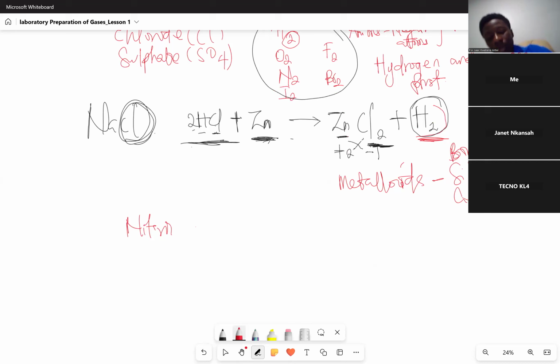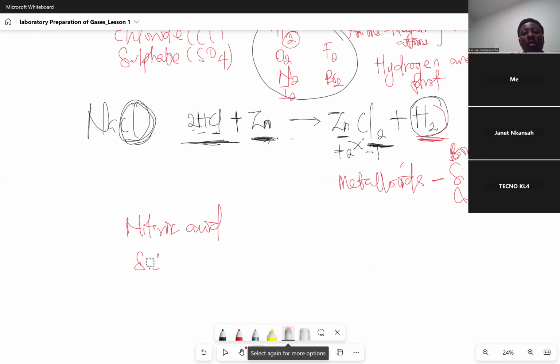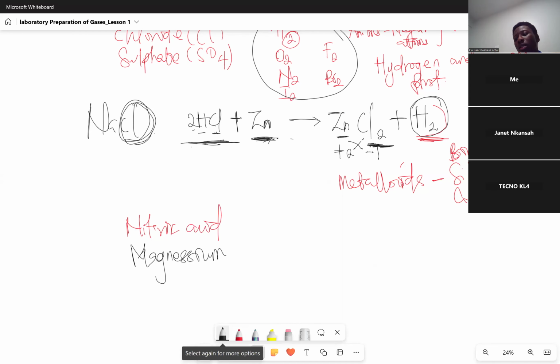Then in the round bottom flask, maybe they'll write sodium, or a metal like magnesium. Are we together? Yes, sir. They'll just write these.